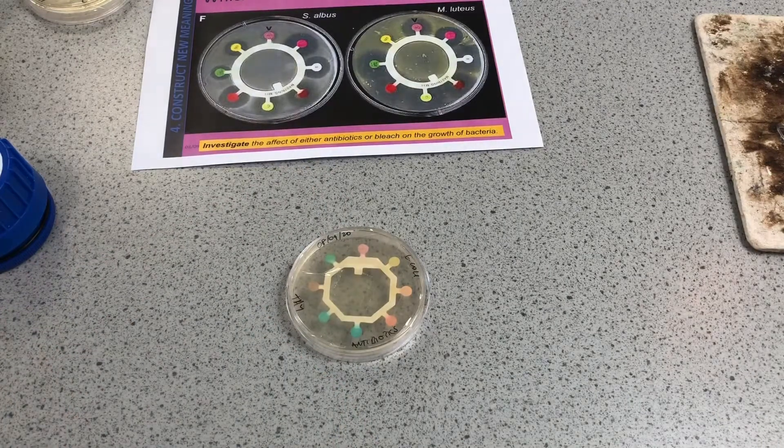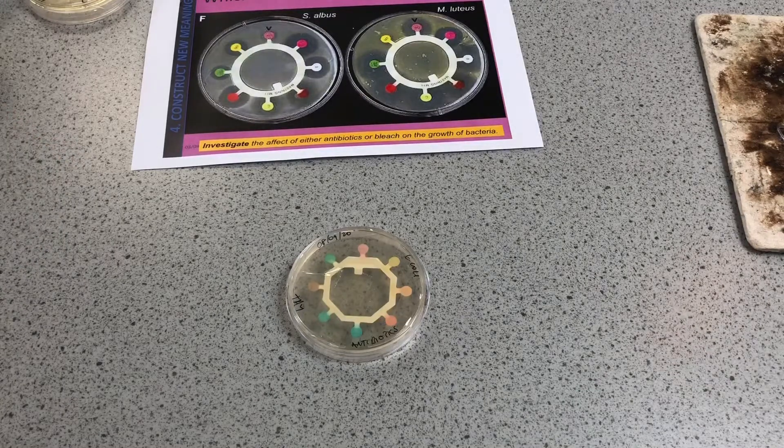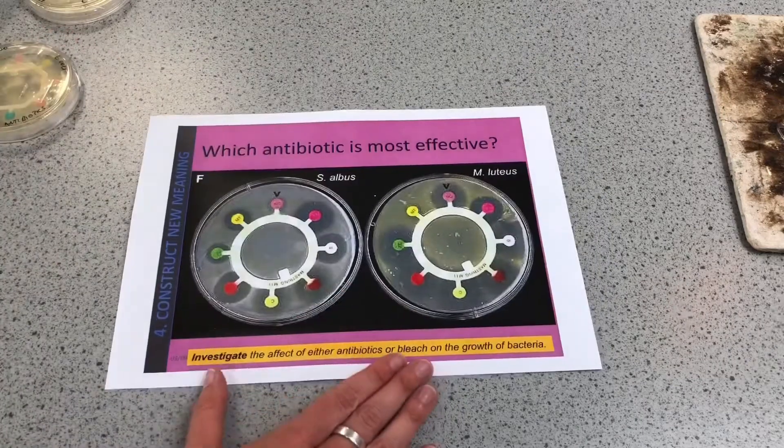That's set up and it's going to go in the incubator at 25 degrees C, which is the temperature we're allowed to use at school. If this was in a laboratory testing for a patient, they can use much higher temperatures because they have a better controlled situation to make it safe. Then we'll look at the zone of inhibition.